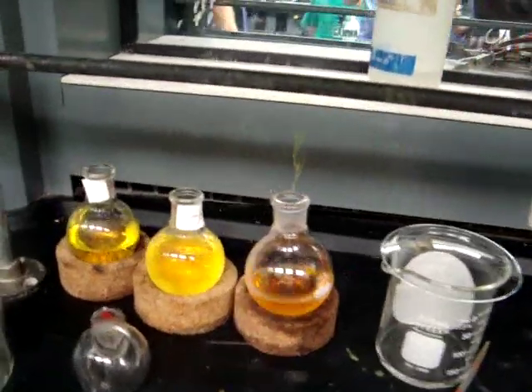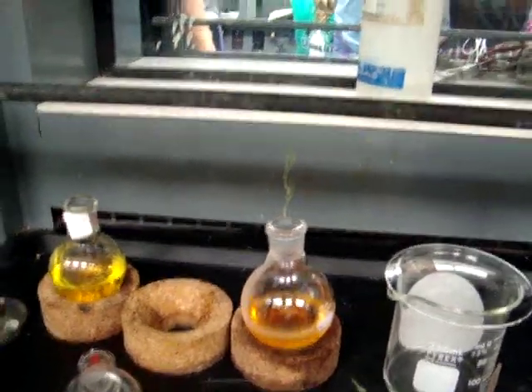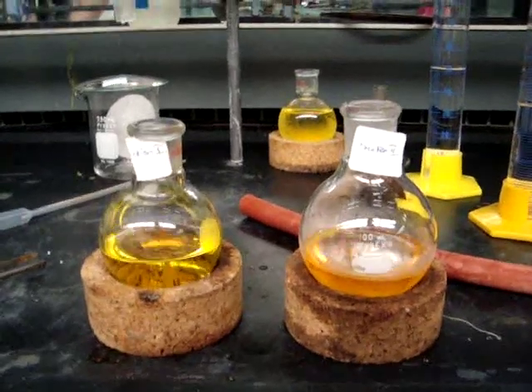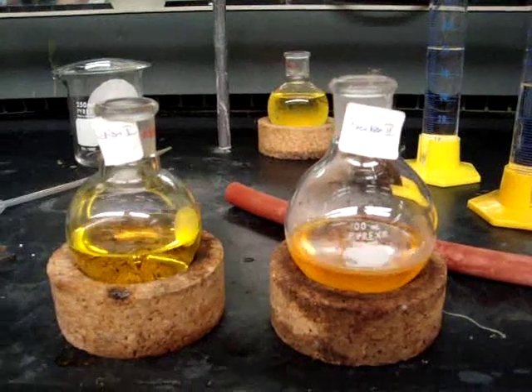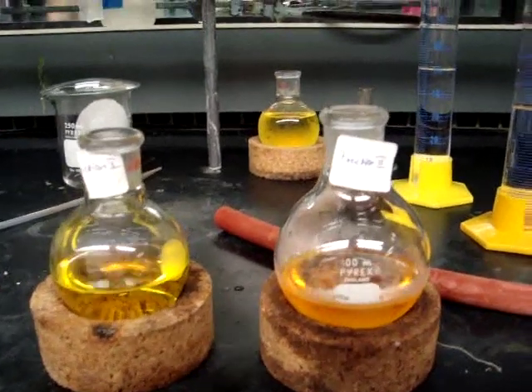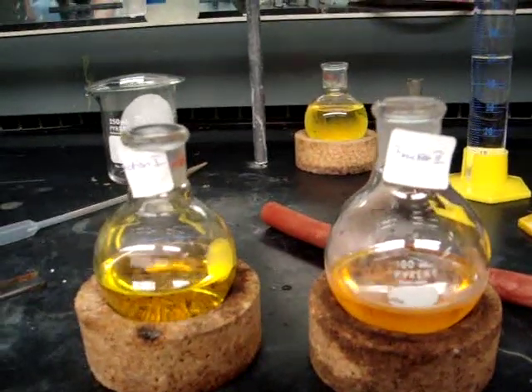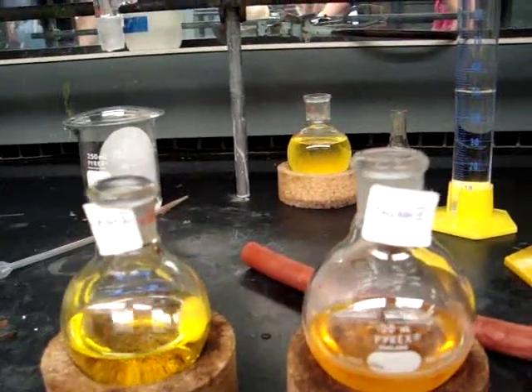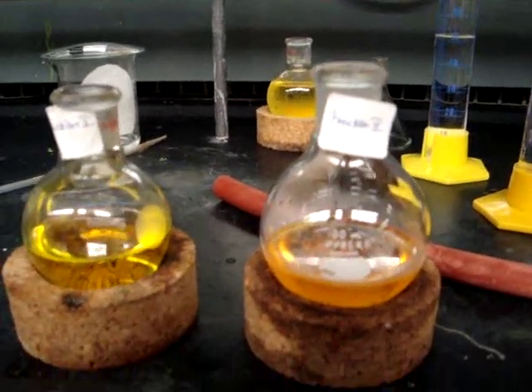As you can see, looking at your two round bottom flasks — the left being the beta carotene and the right being the lycopene — they have retained some of the original color seen on the band. The beta carotene will be a yellow color, and the lycopene will be a red or orange color.